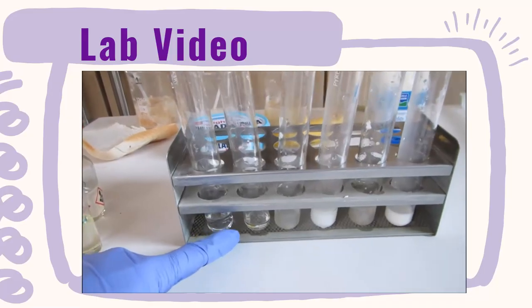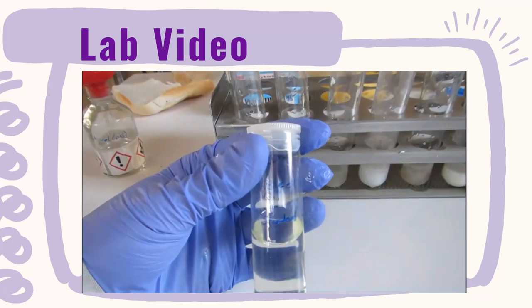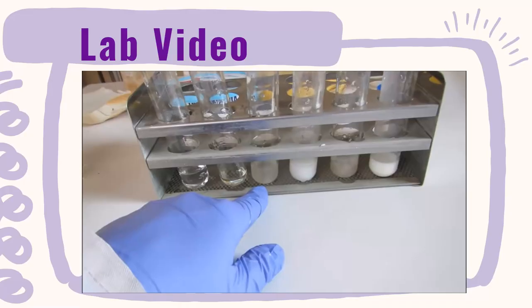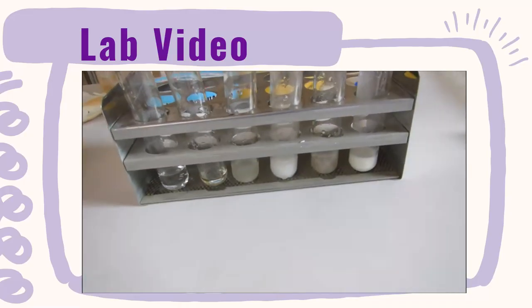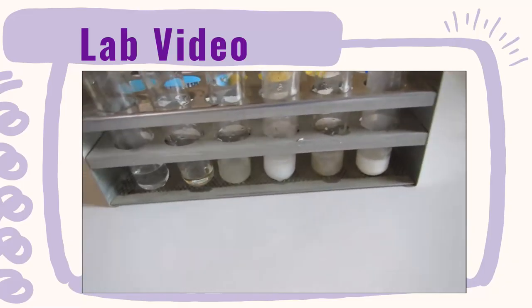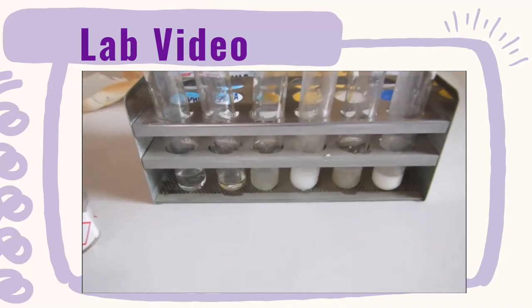Next food test is for fats. So as before, I've set up the test tubes. In the first is the deionized water for the negative control. In the second is for the positive control. So for fats, I've just used olive oil. Then we have our bread, our cheese spread, our banana, and our milk.